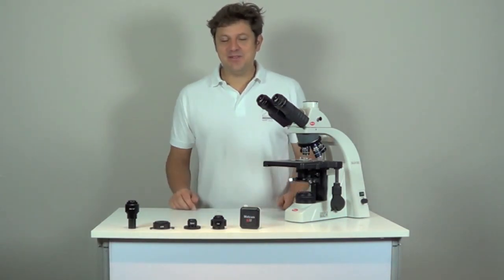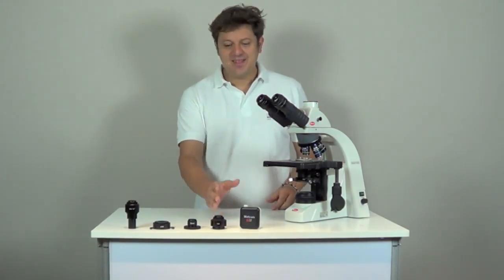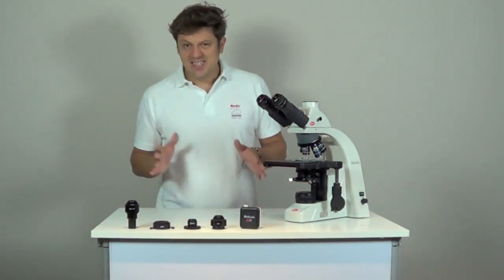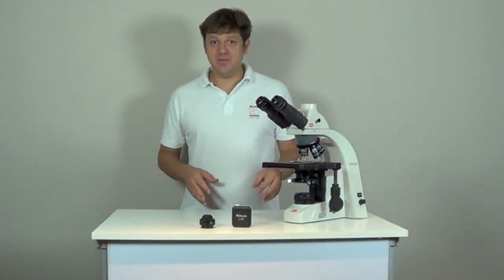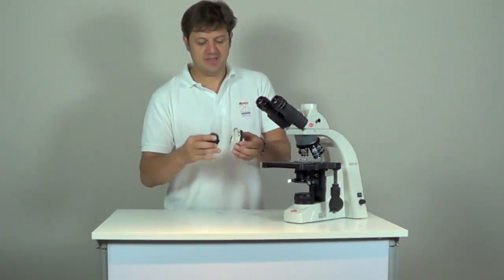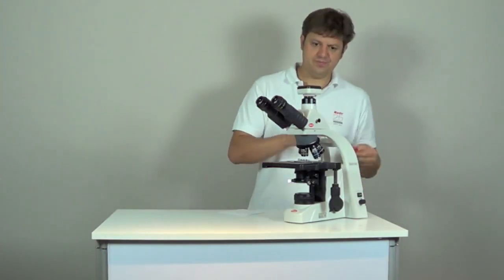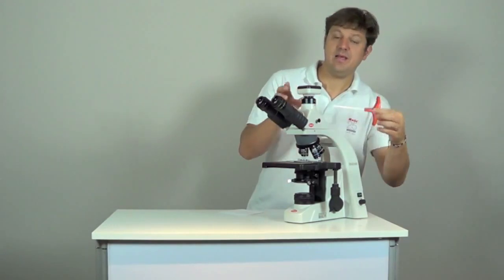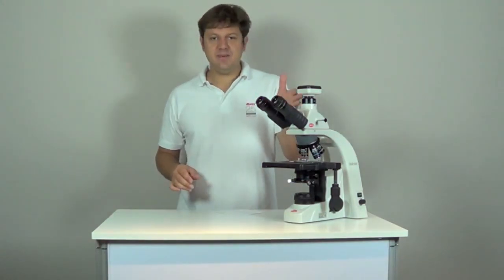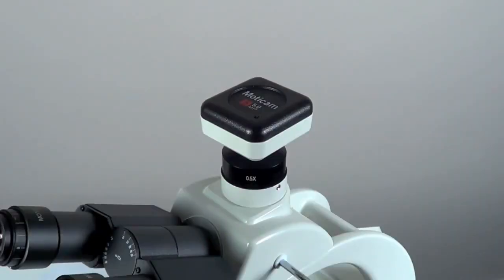There are three ways to connect your Maticam to the microscope. If you have a trinocular port, you can use the C-mount adapter. If you don't have a trinocular port, you can use either the eyepiece adapter or the BNS adapter. If your microscope has a trinocular port, connect your Maticam to the C-mount adapter and fix it on the trinocular port. Remember to pull out the beam splitter so that the light path is open. The C-mount adapter is different for each model of microscope and also depends on the sensor size of your camera. It is not included in the Maticam box.